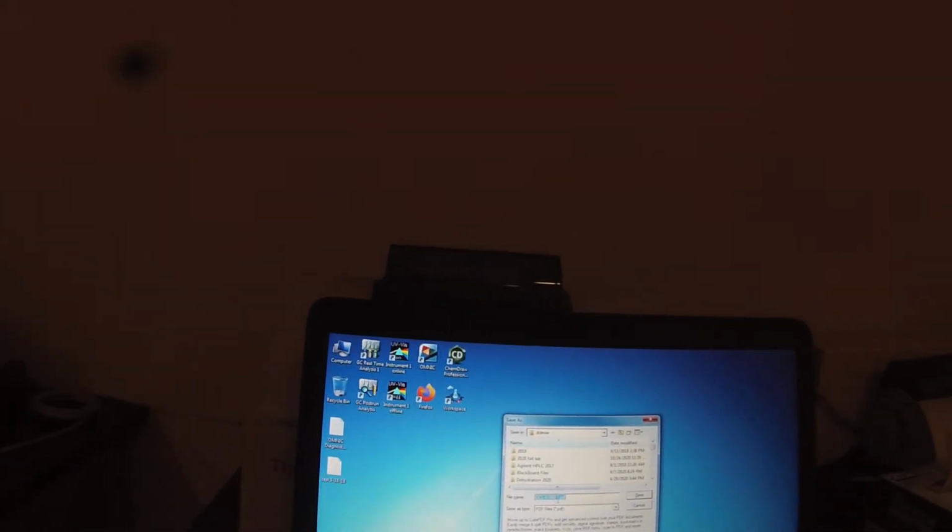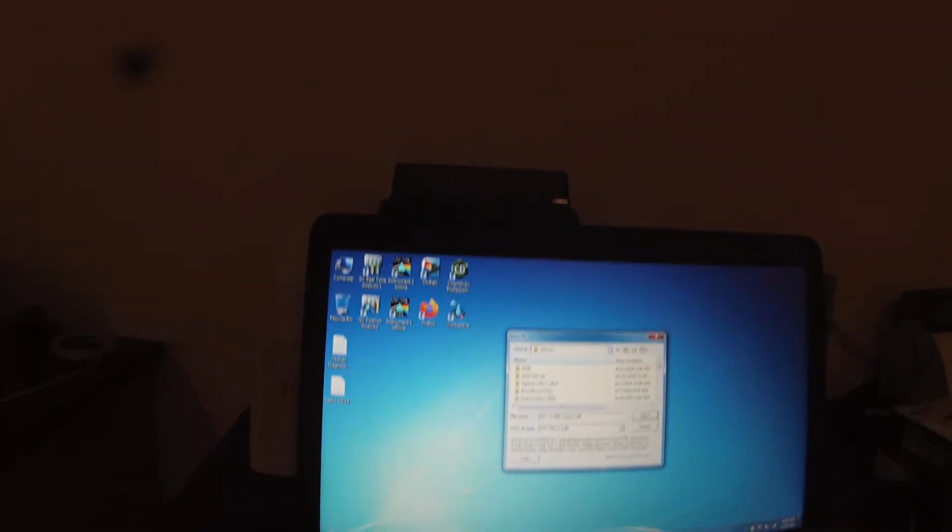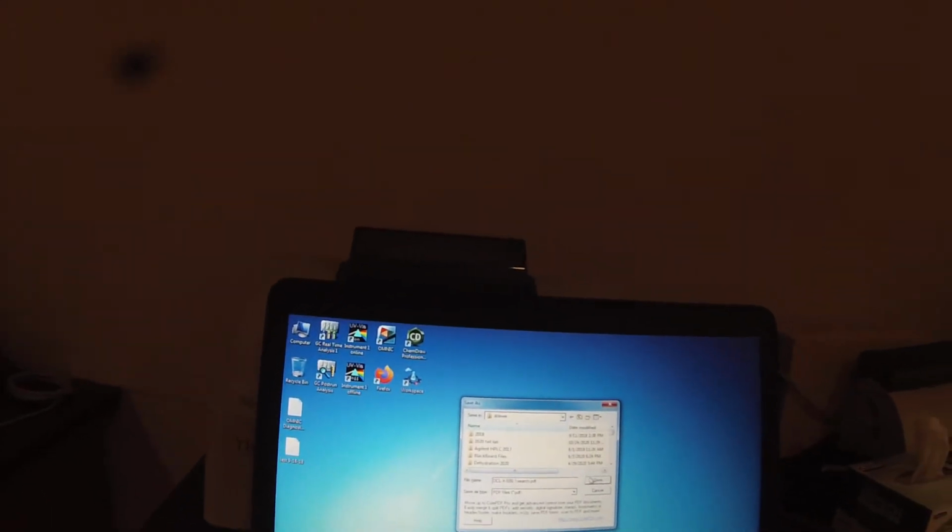Oops, what did I do? I lost my print window. Here it is. And this is the search result. I'm going to print that as 50B1-search.